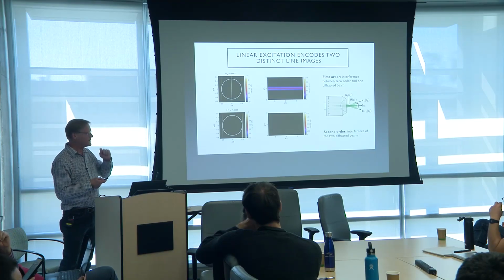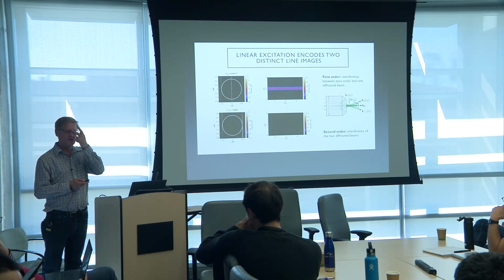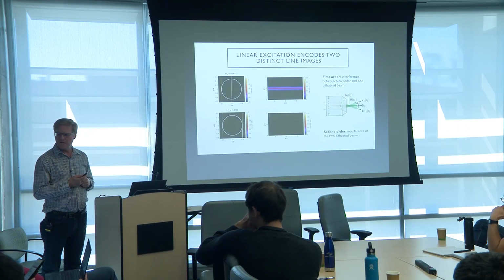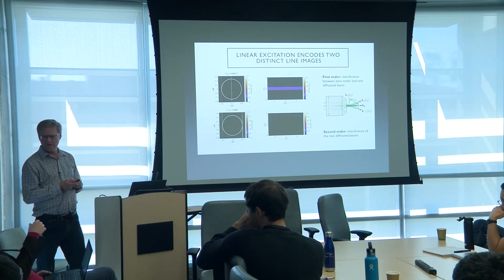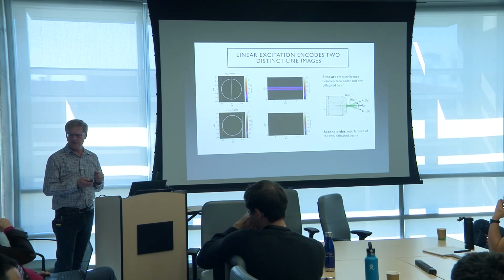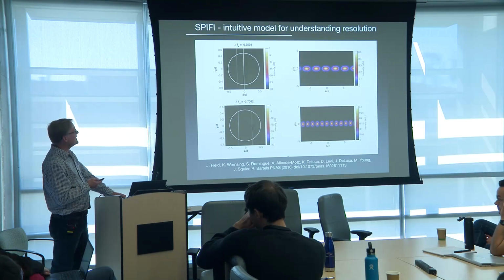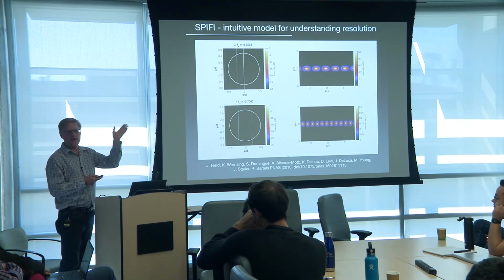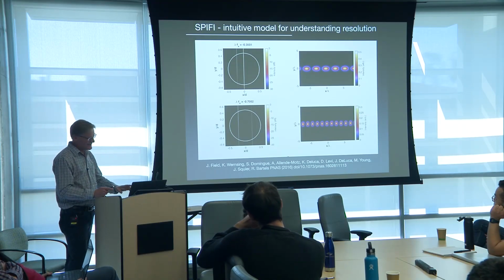You mean coherent imaging with half the wavelength? No, as in if you're looking at a transmission image through a microscope objective with laser light versus incoherent light, you lose a factor 2 in resolution when you use coherent light. Right. We'll show you, we've got all those aligned, here in just a minute, to make sure.